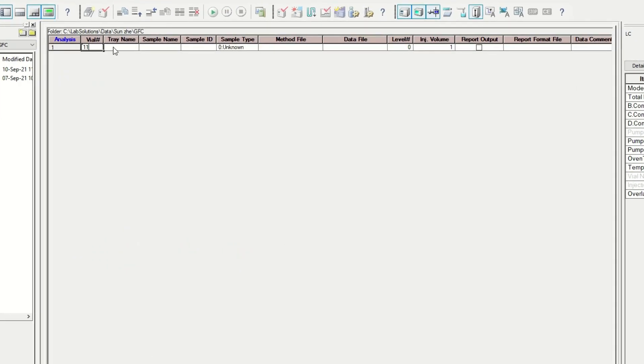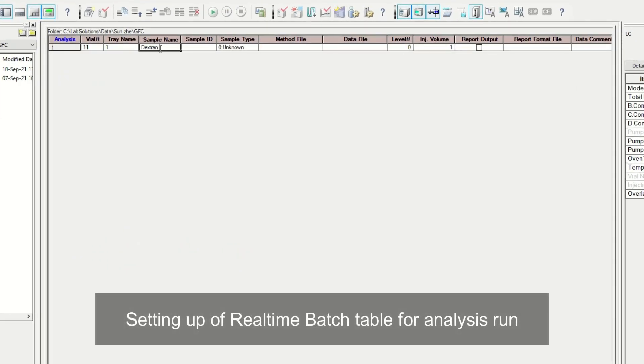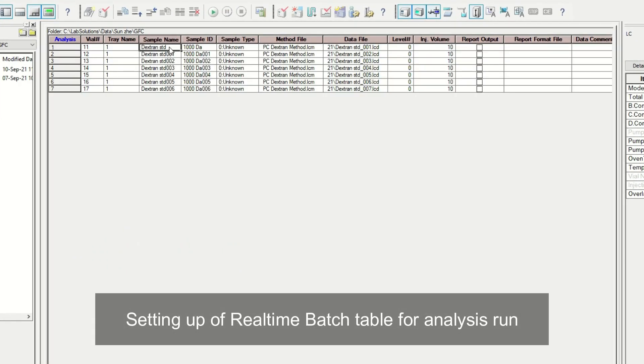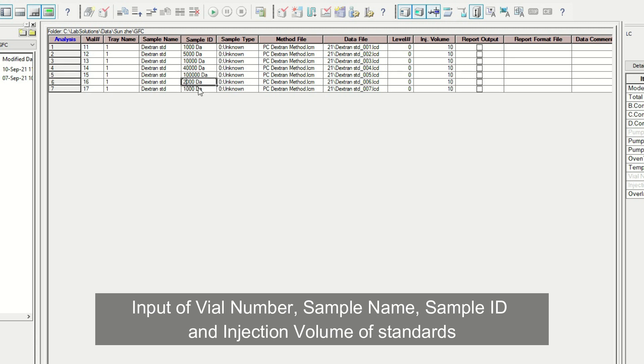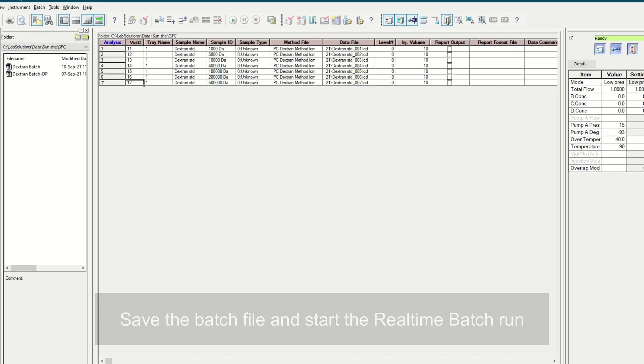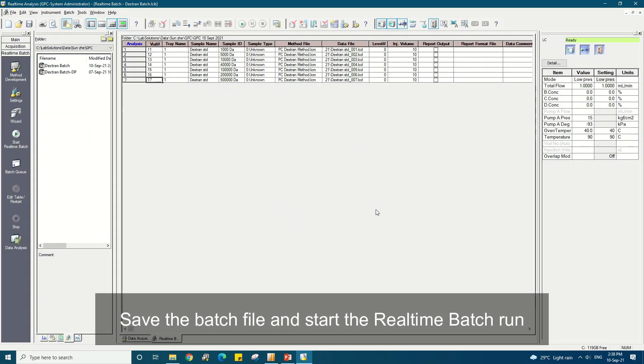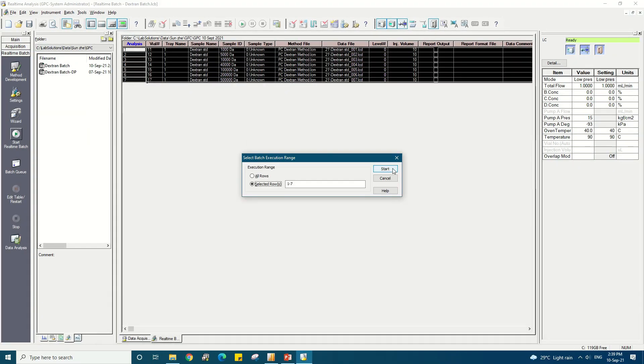After we create a method file, a batch table is set up to allow for the analysis of multiple standards, including all the different molecular weight polymer standards. Input all the relevant information such as the sample name and sample ID for easy identification of each standard. After saving the batch file created, start the real-time batch run.